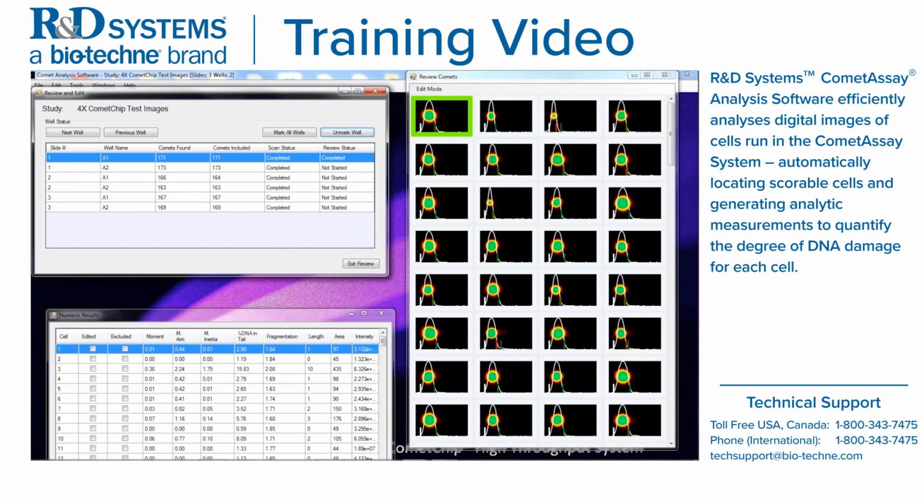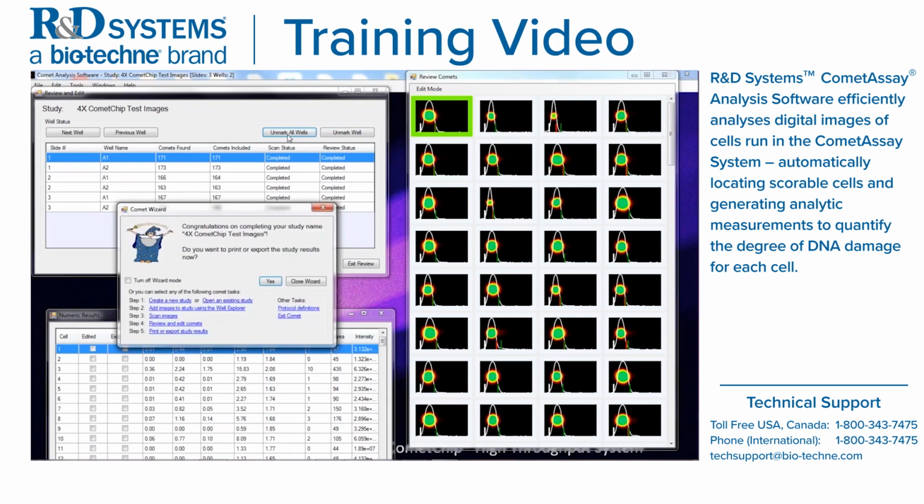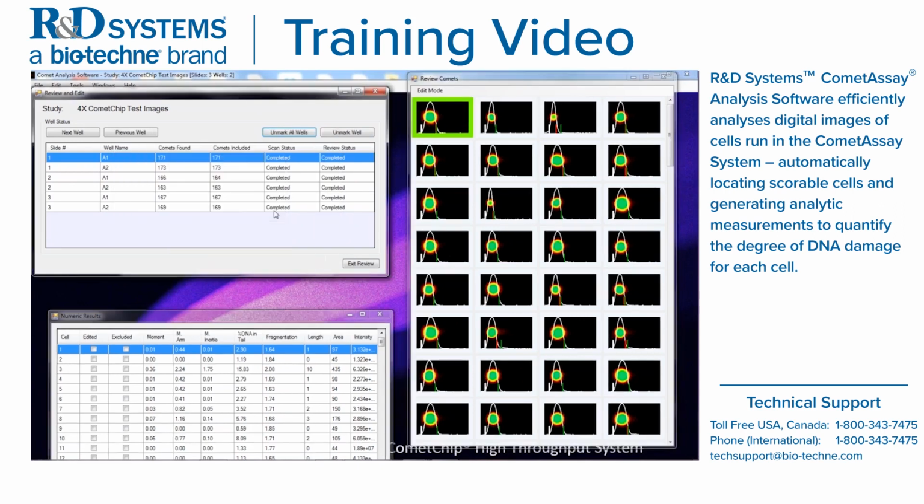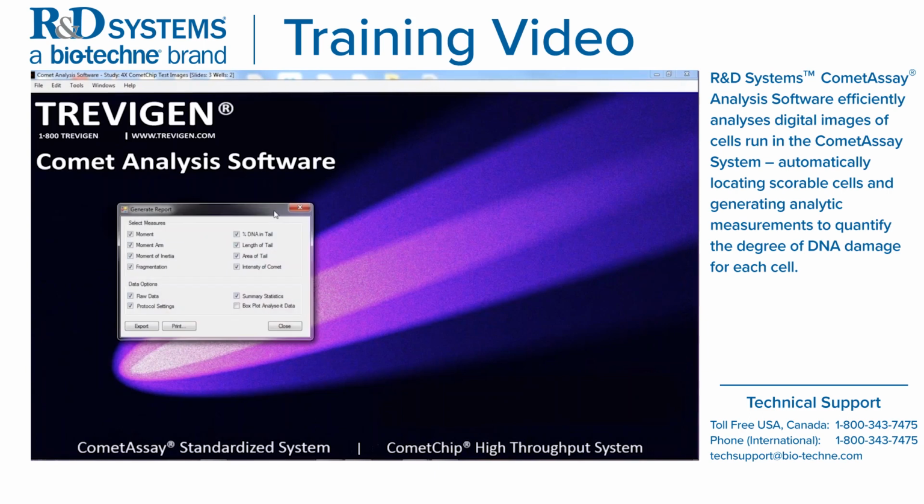So let's assume we've edited everything. You can mark all wells. Once you mark all wells, the wizard is going to come back up and ask, do you want to print or export the study results now? So let's say yes. Now all the windows have closed, and what we're seeing is the Generate Report window.